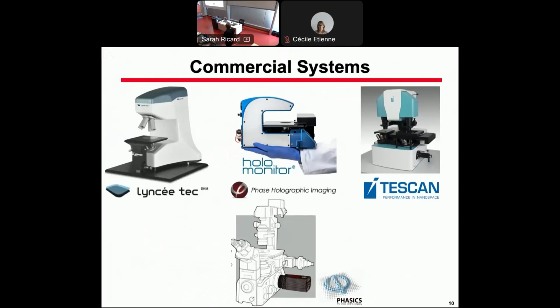The good news is holographic microscopes are available. Lyncée Tec makes high resolution ones. Phase Holographic Imaging now has a small model which you can directly put into an incubator, so you can make movies of cell cultures.